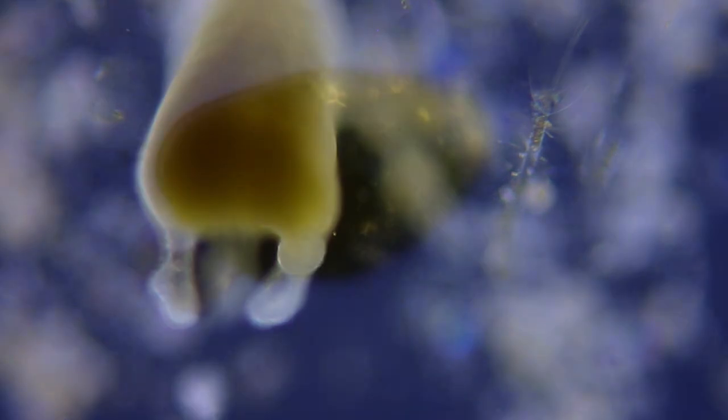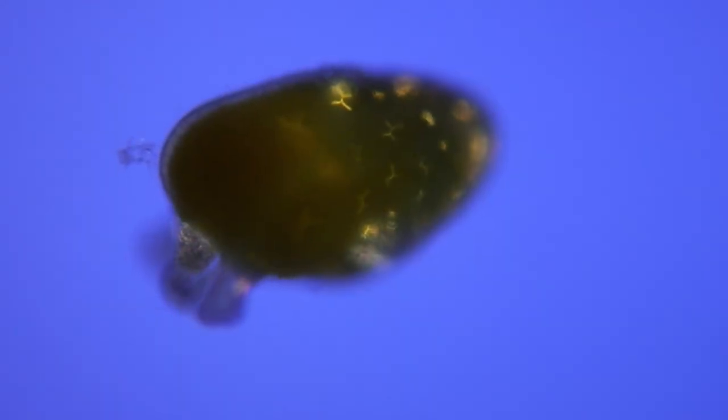Microscopic ossicles just below the skin are shiny and birefringent in polarized light.